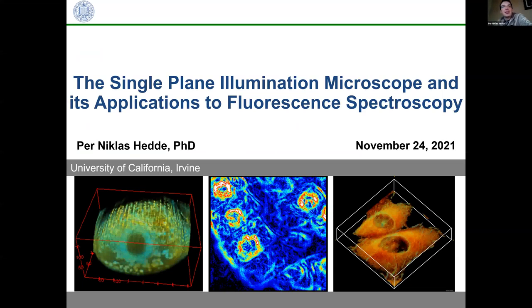So this presentation is going to be an introduction overview of light sheet microscopy, and then some application with regards to fluorescence fluctuation spectroscopy.